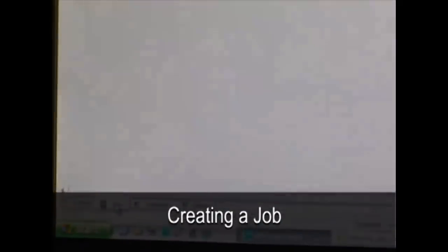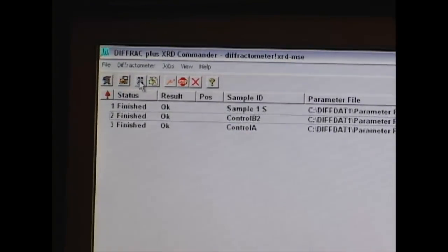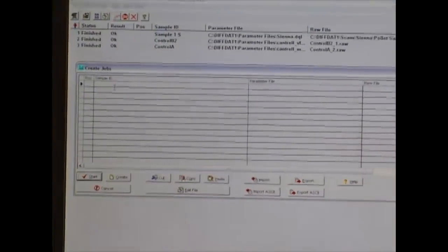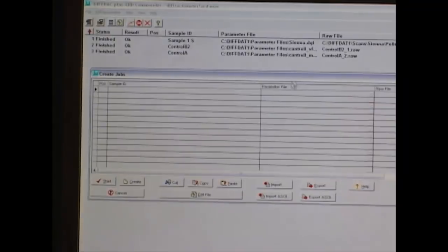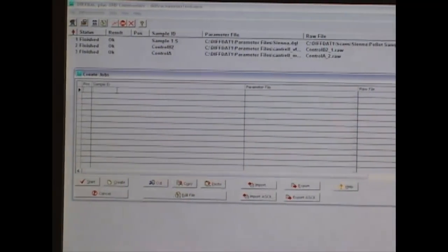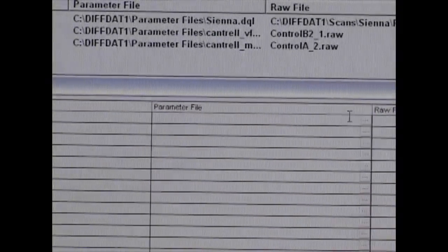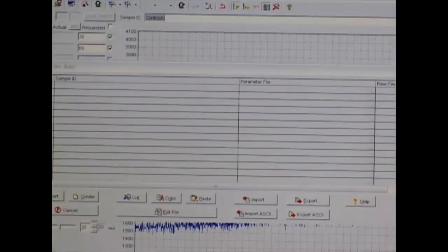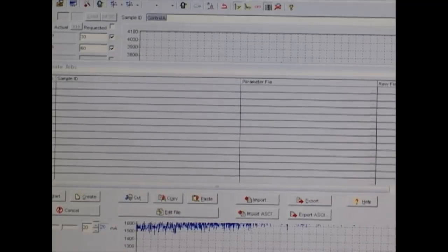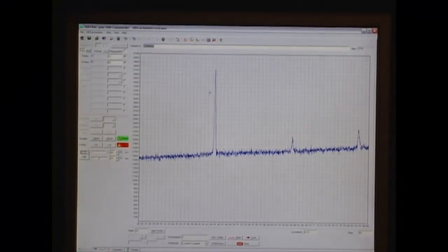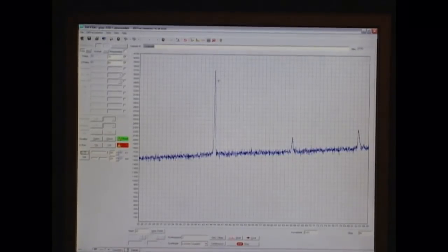If you come down here at the bottom, you'll see a number of tabs. So, in the jobs tab, this is where we create our job. Go to the tab and you can either select the menu and create jobs or you can select the icon that is the same as the jobs tab down here. Create jobs and this dialog has a number of fields in it, but the only three that you care about is sample ID, parameter file and raw file. In sample ID, this is similar to a header. This is just information that will go in your actual sample. Your parameter file is the parameter file that I'll show you how to set up in just a second and your raw file is the file where your data will be saved. Running a scan from this window and from your parameters and hitting start here ensures that the data is saved automatically. What happens is people will go and run a scan here and go to lunch and knock it back in time and someone who signed up for the instrument right after them will come and run a scan over it and your data is gone. That doesn't happen if you do it from the jobs tab.